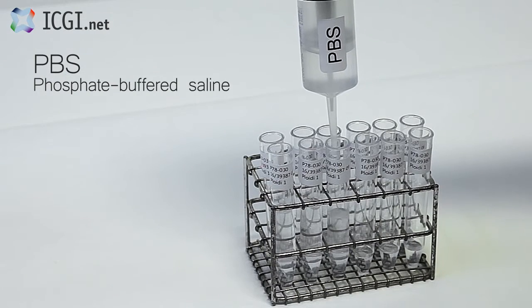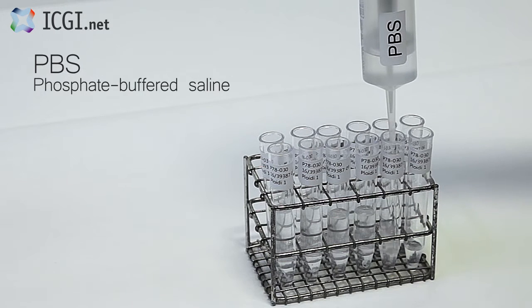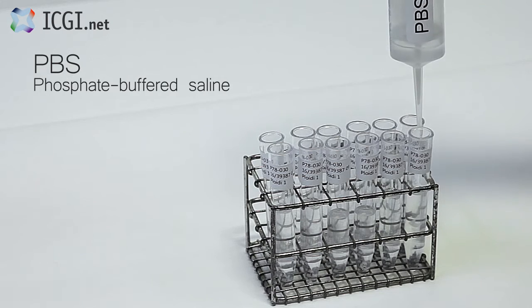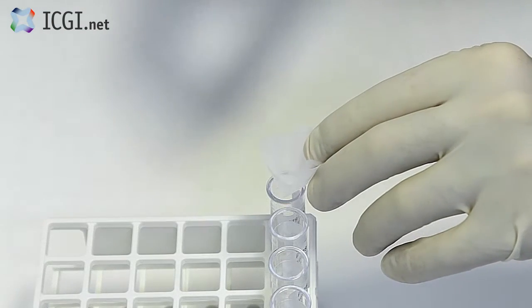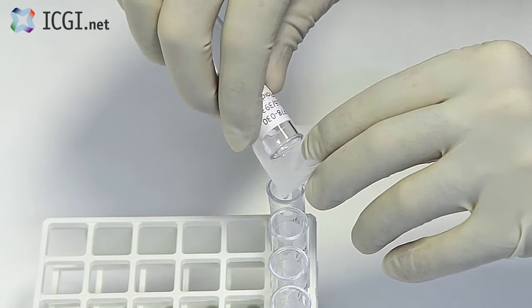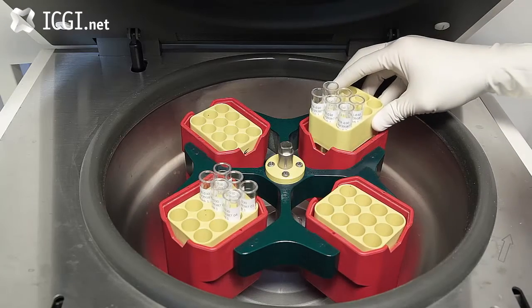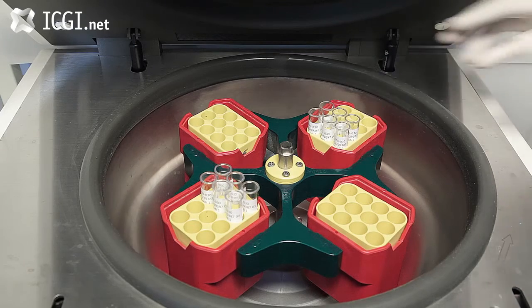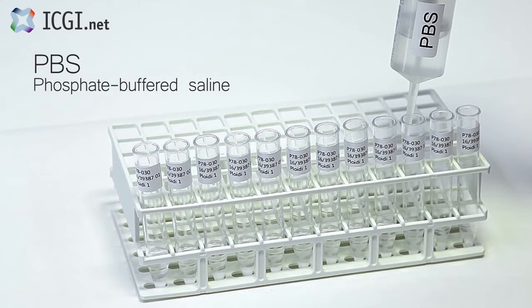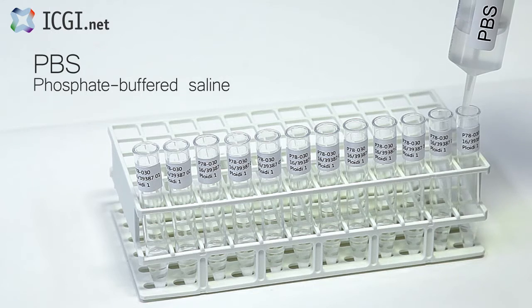The enzymatic reaction is stopped after tissue disruption by diluting enzymatic solution 7 times with cold PBS, and the magnetic stirring bars are removed. In order to filter tissue homogenate and make the nuclei solution as pure as possible, it is filtered through a 60 micrometer nylon mesh. The filtrate is then centrifuged at 800 G for 20 minutes to pellet the nuclei. Then, the supernatant is discarded, and 0.5 to 3 milliliters of fresh PBS is added depending on the size of the pellet.